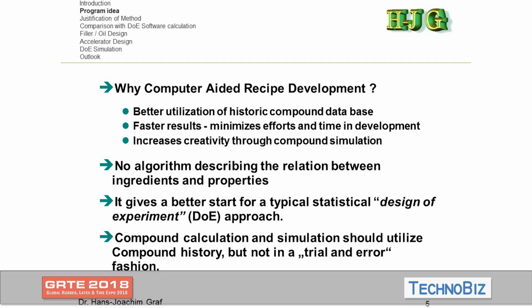So the creativity portion of my brain should be used. Those data I cannot describe with any algorithm because I can make only statistics of that, and I have no algorithm like the regression equation you have seen. So that gives me already a start, a compound, which I then used in a type of DOE to explore the surrounding of this compound idea.